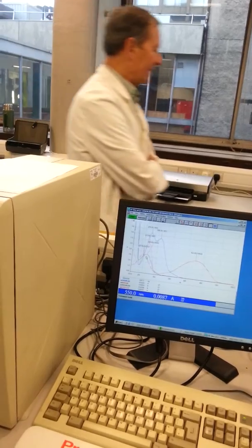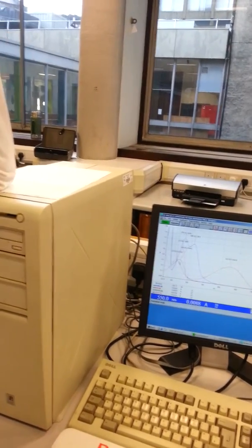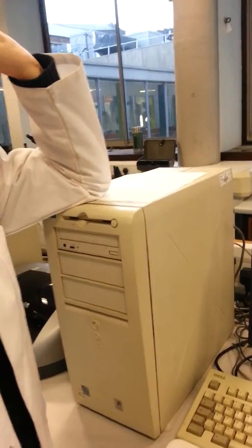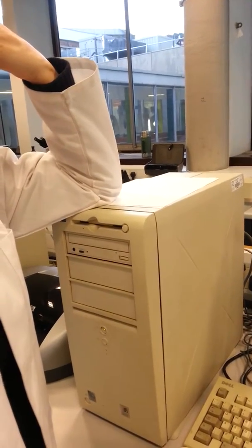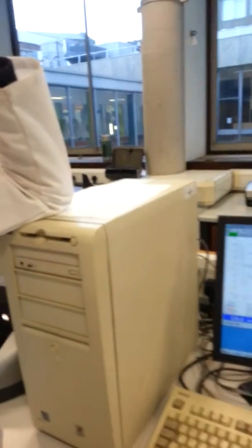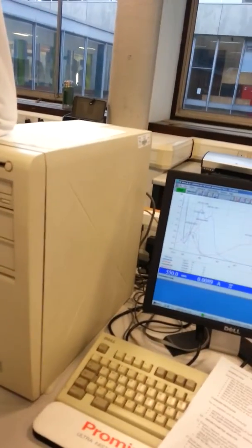So you were saying earlier about the absorbance, the 1%. The Beer Lambert law one, 1% volume. So you have to work out the extinction coefficient. That's in that Beer Lambert law thing, and then that's that times the volume times the concentration times the cell path length. So it's 1 centimetre. The suggested wavelength is 258, 259. And then we can't do the second part till next week when we've tested them all at that wavelength. Is that right? What's the second part?